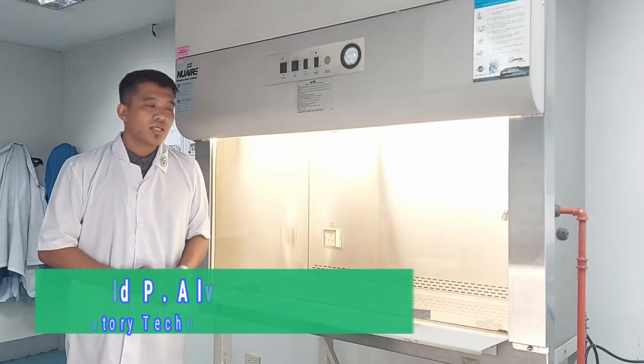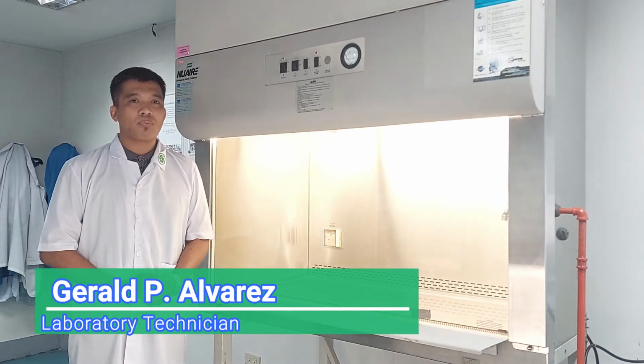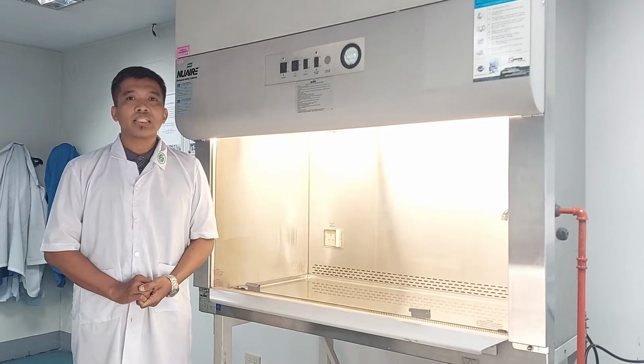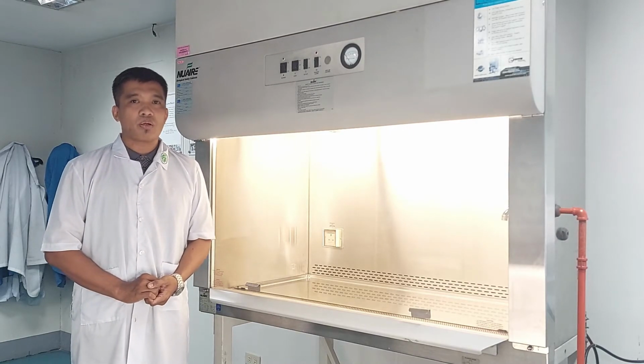Good day, lab mates! Biological Safety Cabinets, or BSC, are parts of engineering control in the laboratory to provide an optimum safe environment for bioscientists' work. This control has been acknowledged as a basic requirement for personnel and product protection.